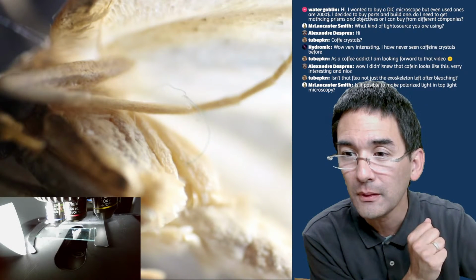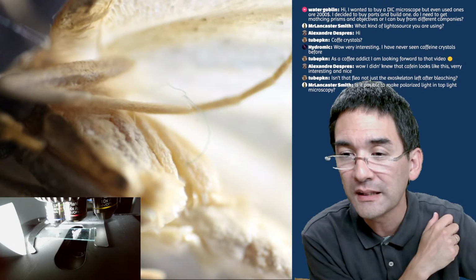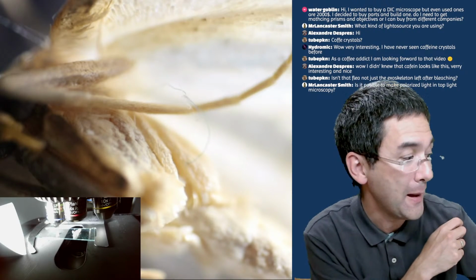Is it possible to make polarized light in top light microscopy? Haha.